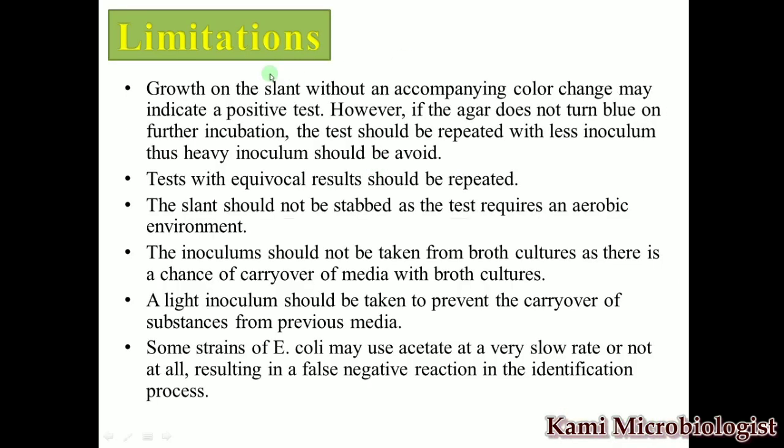Now let's see the limitations of this media. If you observe growth on the slant position, it may be taken as a positive result. So remember, this type of mistake mostly occurs due to heavy inoculum. What does it mean? It means that when you want the correct or the best result, you have to perform the test with less inoculum.